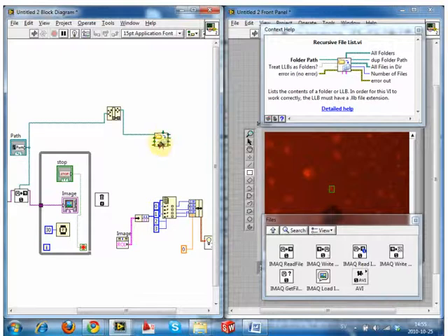So right now you have all these. It took me quite a while to figure out why my example doesn't work. Yeah, or your example doesn't work on my computer. I had all the LabVIEW files in the folder. Yeah, if you want other files in the folder, you have to give it some pattern. You have to say it has to be a certain type of file.